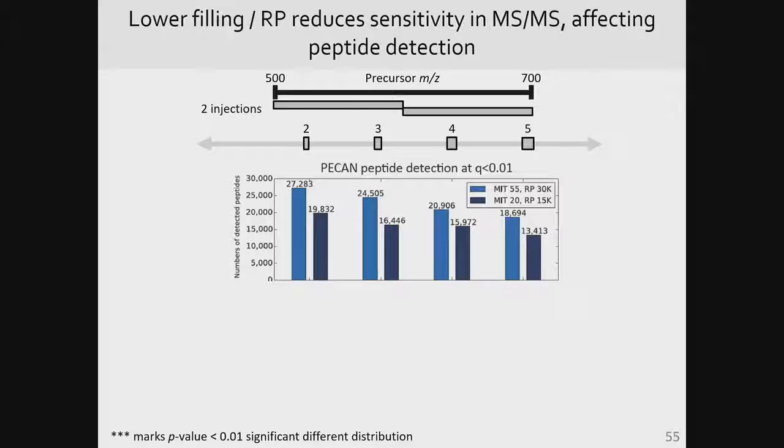I think the quantitation will be even more dramatic, because with a maximum inject time of 20, while you may have twice as many points, all of these have enough points to define the peaks. They're all above the 8. So it does reach a kind of plateau. What this means is that we're now dealing with fewer ions, but at about 16 points across the peak as opposed to 8.